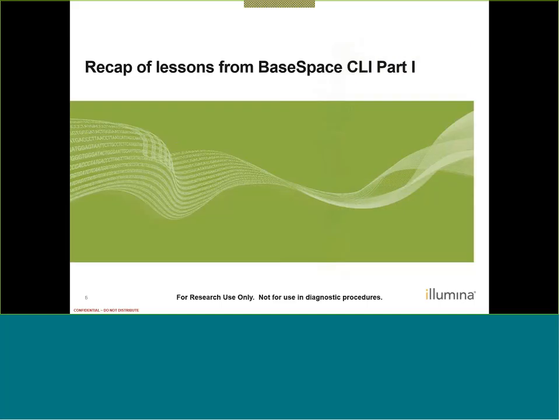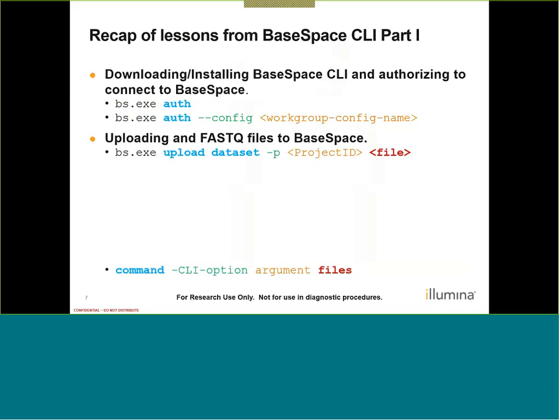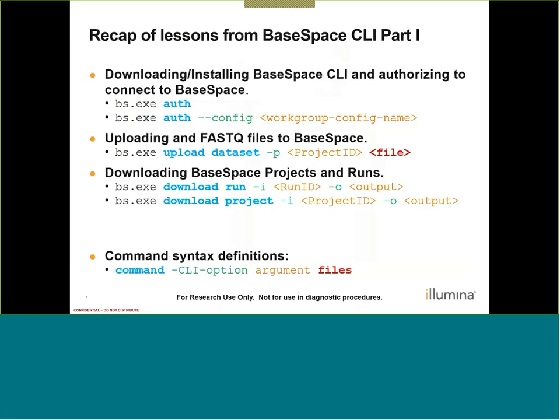So just as a quick recap, these are some of the lessons that were taught in the Part 1 webinar for BaseSpace CLI. The first and foremost was downloading and installing the actual program and then authorizing it to work with your particular work group or your BaseSpace account. The next was uploading FASTQ files so you can actually process the data and do analyses with the apps on BaseSpace. And then we also went over downloading run and project data from BaseSpace.